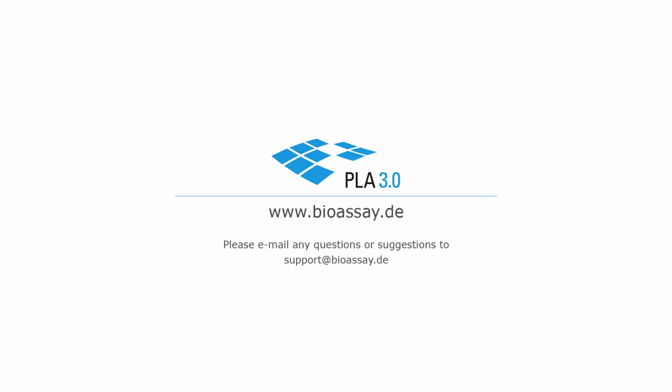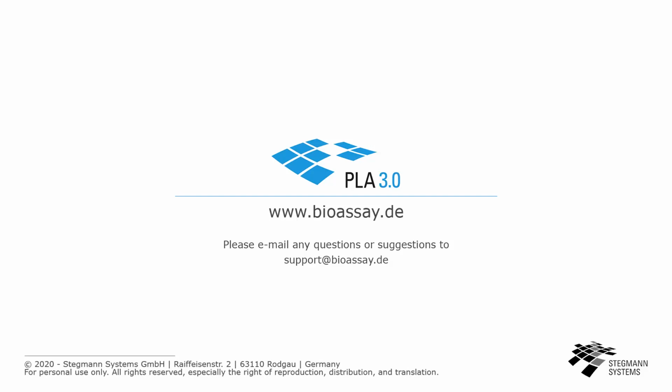If you transferred the license to a new computer, you still need to apply the license keys in PLA. In this case, please consult Part 3 of our video series called Activate Your PLA License. If you want to know more about licensing PLA, please consult our guide on planning, installation, and licensing.